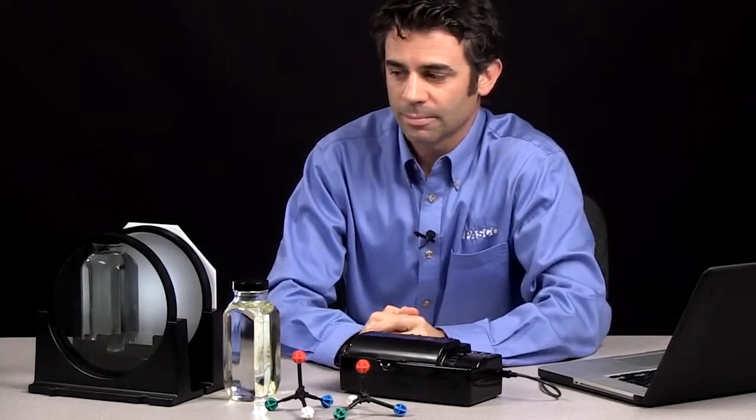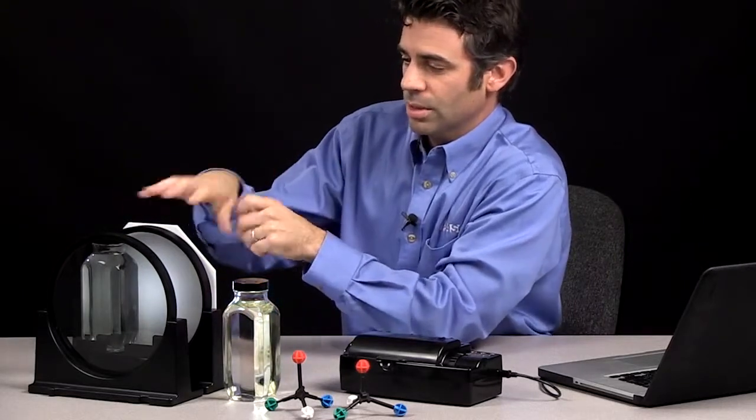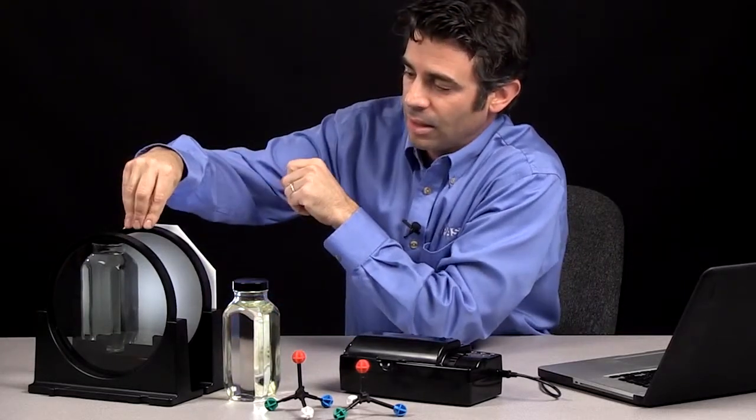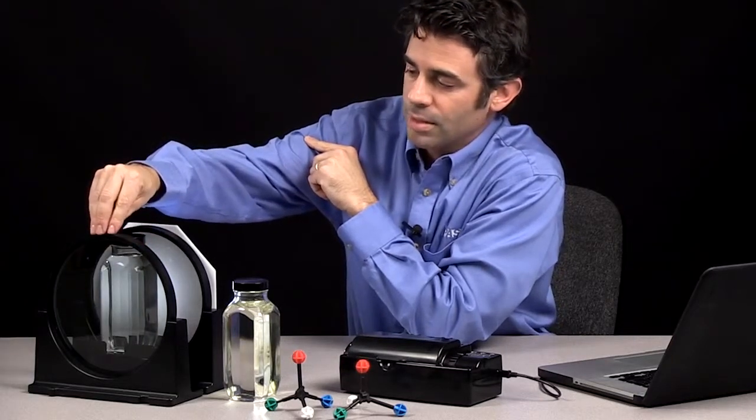So what does that mean, plane polarized light? Well, I can demonstrate that over here. So I have a light source in the back, I have a polarizing film, I have a sample of water, and I have another polarizing film.